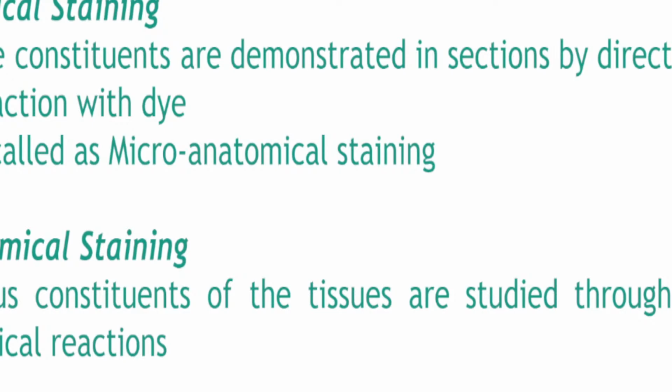Kasi dati, ang gagawin lang naman natin sa histology class natin, identify the cell, right? Identify what types of epithelial cells do you see in your cheek swab? Ganun lang yung tinatanong sa atin. Kasi the first thing that we did was stain it. Okay? And it has left an impression on all of us. But because our topic is histotechnics, we want to know what is going on with this particular process.